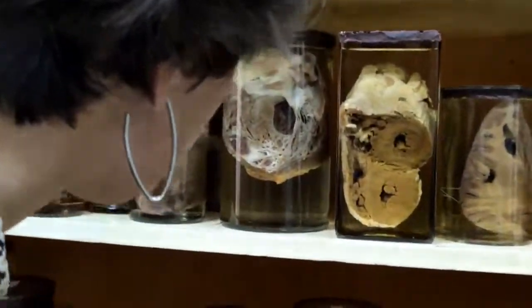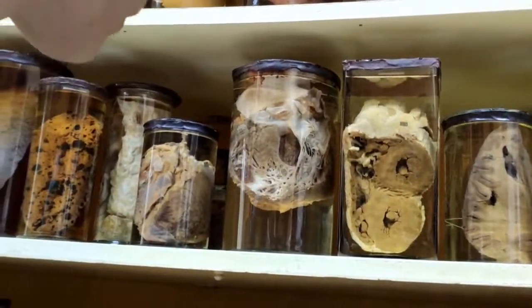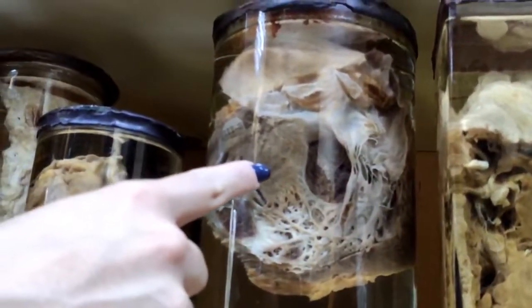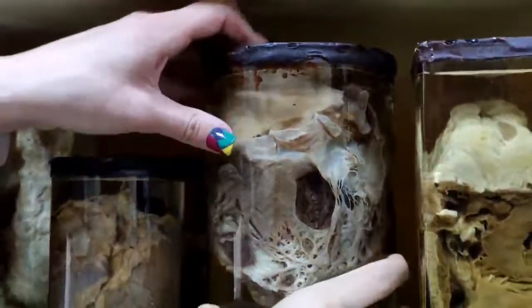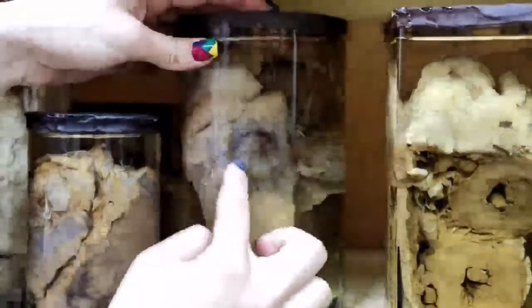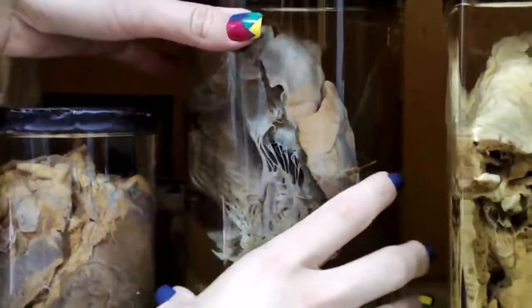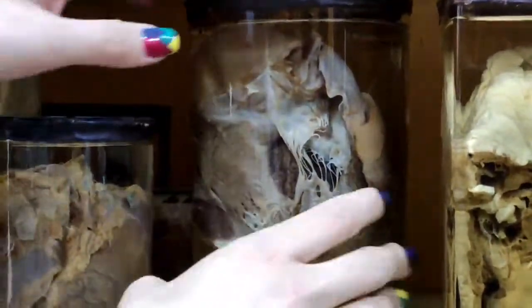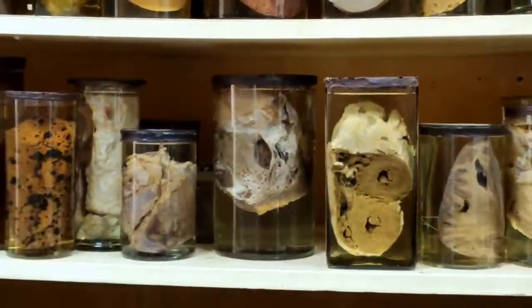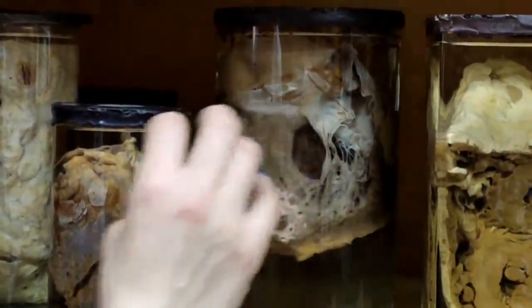The next one is, okay, I guess it's aneurysm of the left ventricle. Aneurysm, you can see here. So you can see aneurysm. This is here. So this is like, I don't know how to say this word. Okay, this is not very stable. And in this aneurysm, you can also see a big thrombus which stabilizes it.